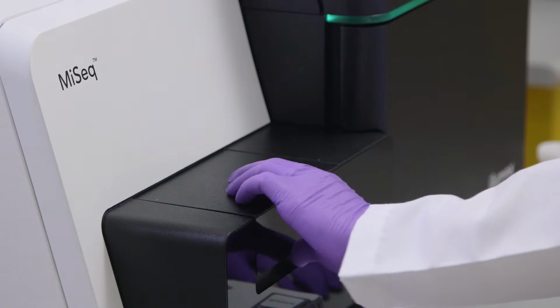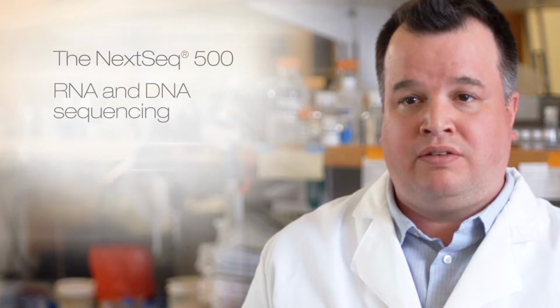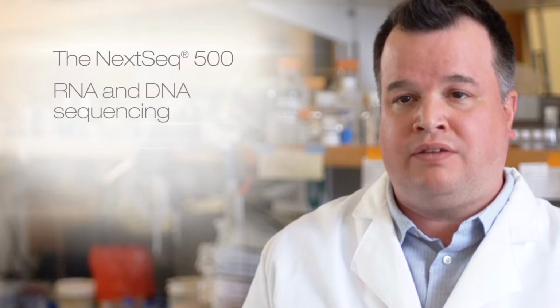It allows us to choose the best instrument for the situation. The NextSeq is great for RNA-seq data. It's great even if you want to do DNA sequencing. It's great if you need a lot of reads. The NextSeq 500 now has become our workhorse for sequencing in the lab. Almost every experiment, every funding mechanism in the lab uses the NextSeq 500 to generate data.